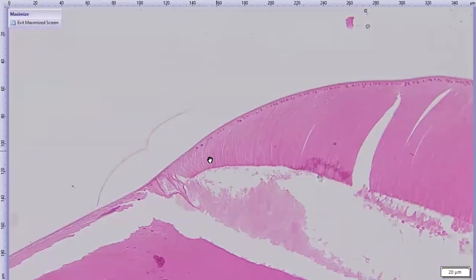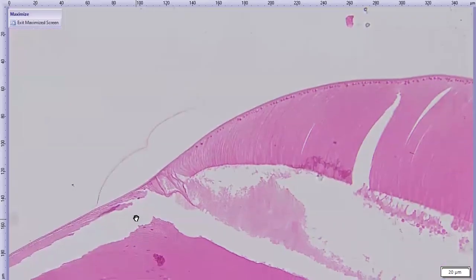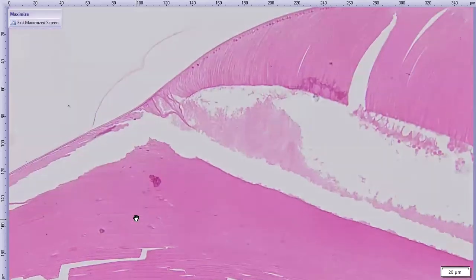Then they undergo a really complex change. They get short, they rotate, so they're now going in this direction rather than this direction. And then as soon as they get incorporated into the lens, they become really long. Then they go all the way from the front of the lens to the back of the lens. And you can see the nuclei are maintained a short distance.